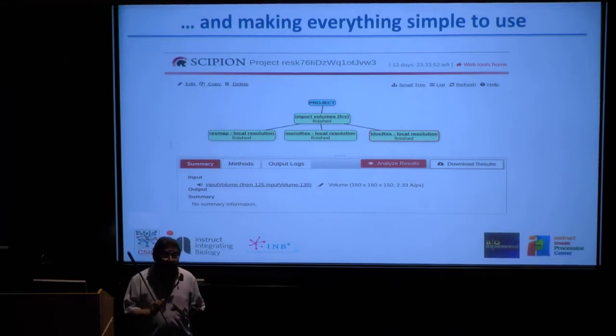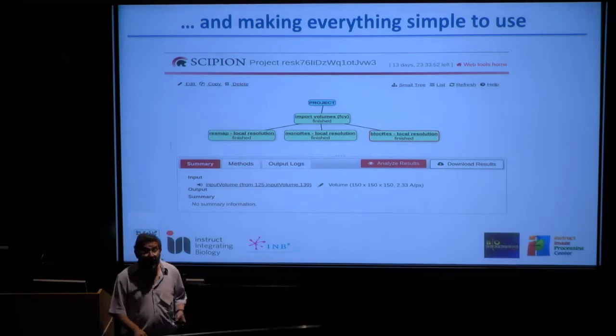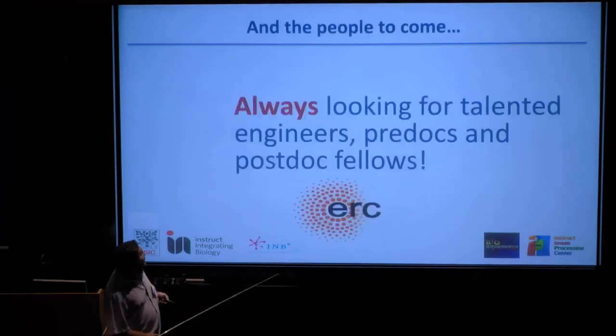It's not yet included, but we will include the directionality and the DeepRes approach there as well. The software works over the cloud, so it's very simple to use and simple to install, and this part over the web doesn't need an installation.